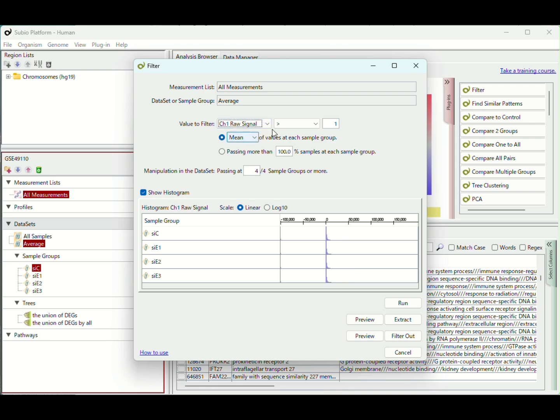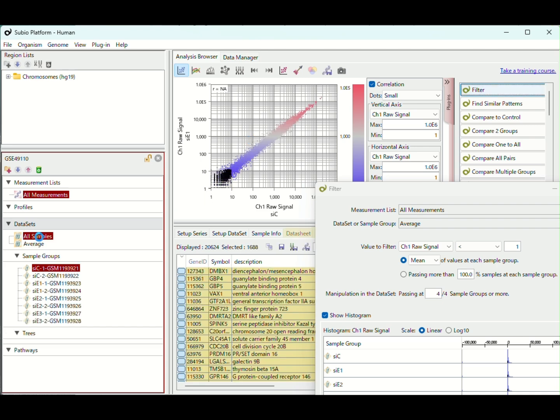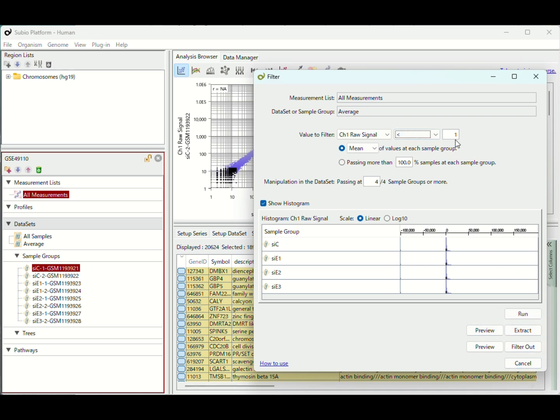We will exclude genes that have only unstable measurements in the low count region. The threshold is not set as a fixed value. Instead, we decided while looking at a scatter plot of the gene counts. Here, we will exclude genes that have gene counts below 20 in at least one sample in every group.